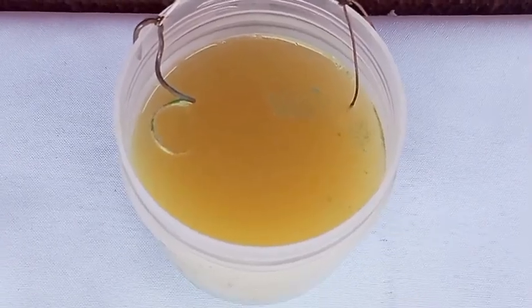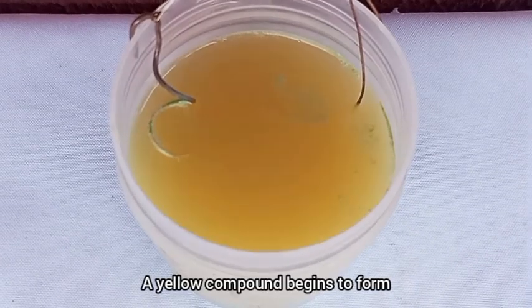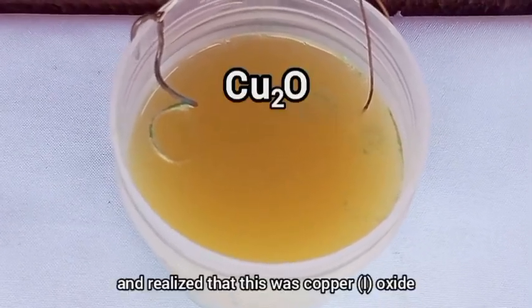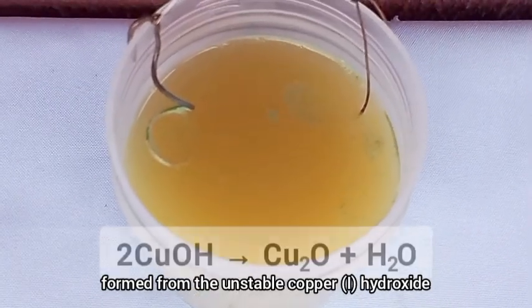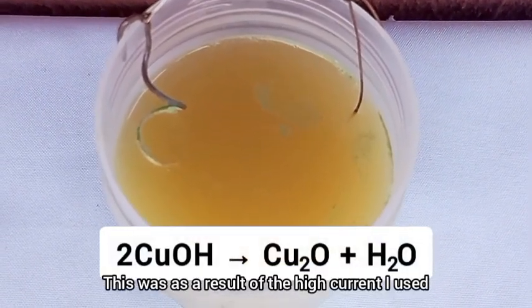About 30 minutes later, something unexpected happened. A yellow compound begins to form. I did some research and realized that this was copper oxide formed from the unstable copper hydroxide. This was as a result of the high current I used.